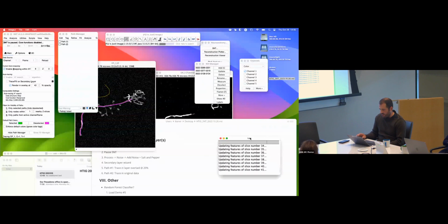This is actually a script. So you see, there is nothing sophisticated about these, it's just a convenience. Most of these commands are actually scripts that just call different APIs and try to do everything, so you have this actual convenience to do stuff. We need to wait.